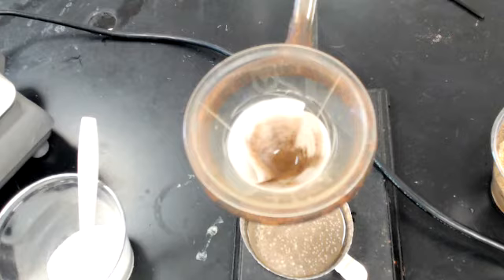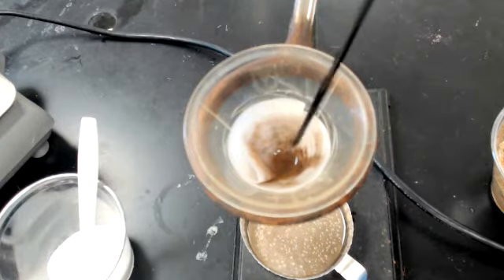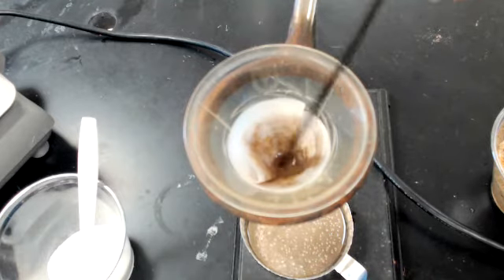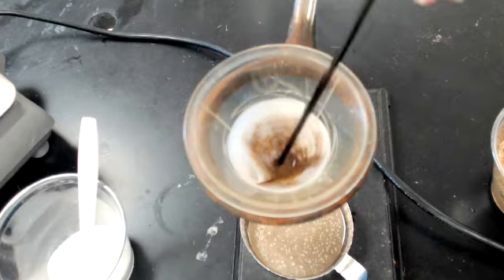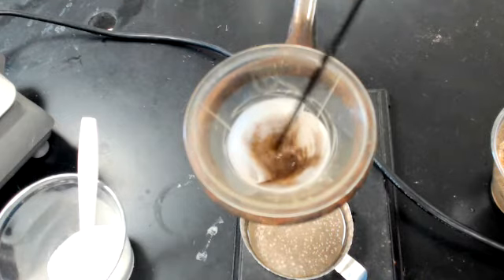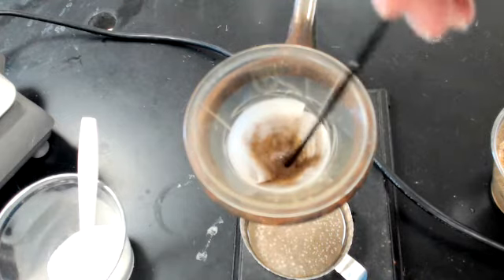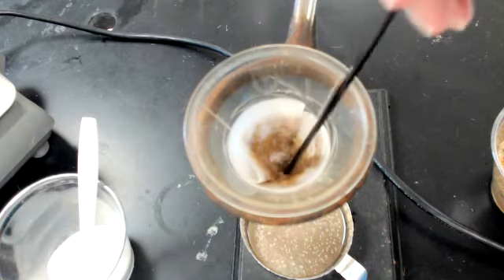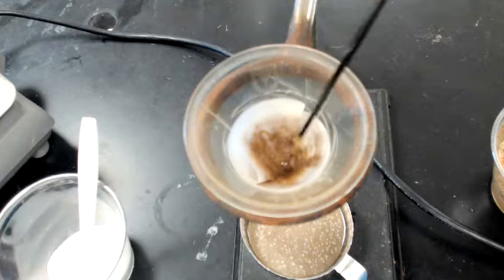So you can see there's just a little bit of liquid now left in the bottom of my filter. And again, I'm going to gently stir. I'm not trying to poke a hole in my filter. I wouldn't want to do that. I'm just making sure the water gets to that filter. Okay, that's actually looking really good right there.